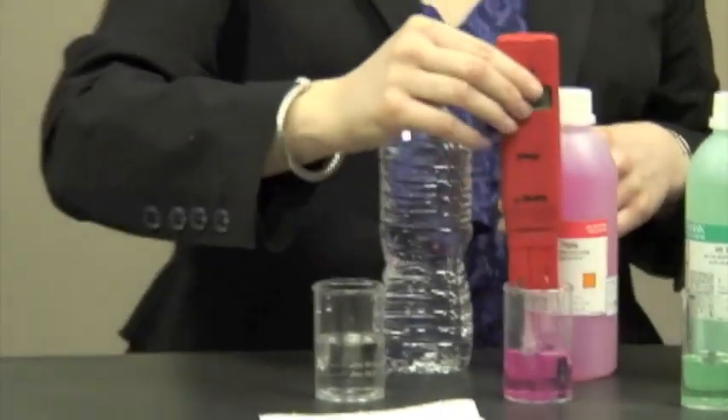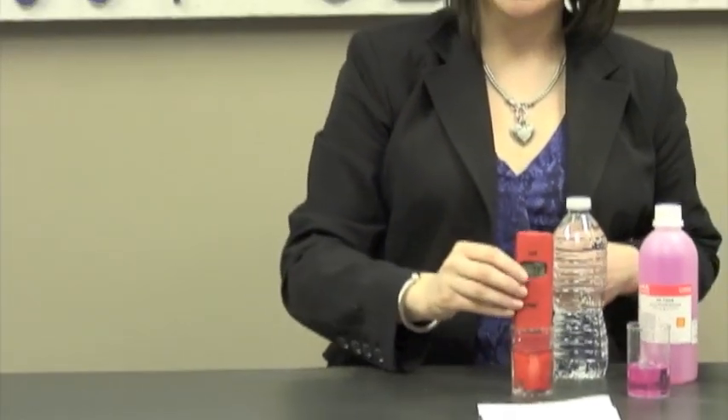Now I'm ready to do my measurement. I'm going to rinse it off one more time, and then I'm going to perform my test.